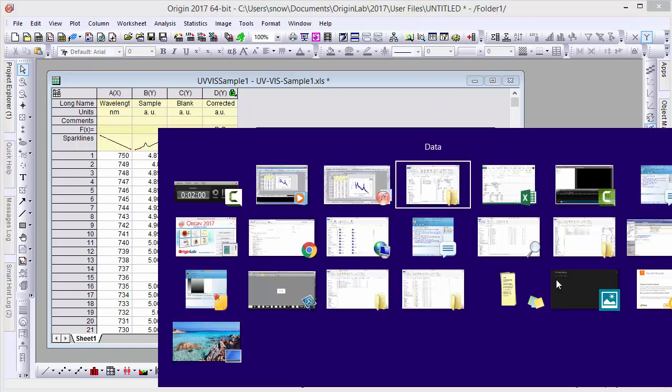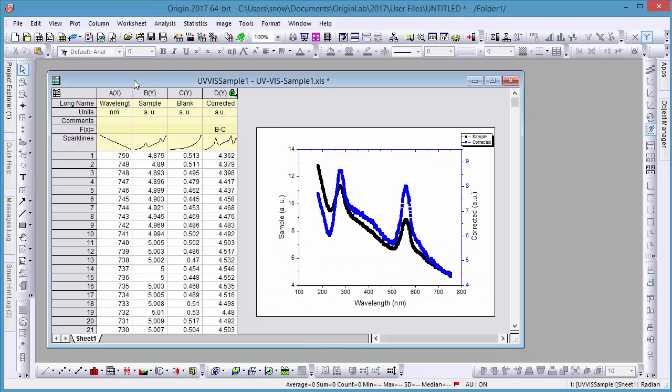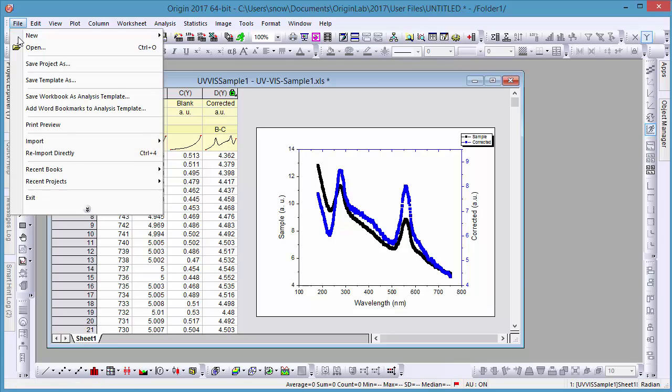Now let's say that our Excel file has changed. Here we've pasted some new data in the sample column and saved it. In Origin, we can easily update our workbook and corresponding data by going to File Reimport Directly.